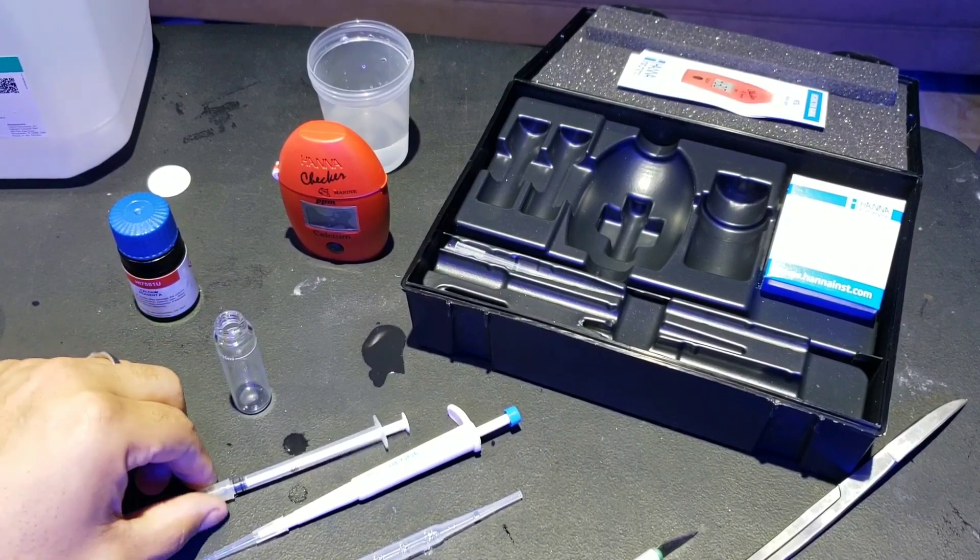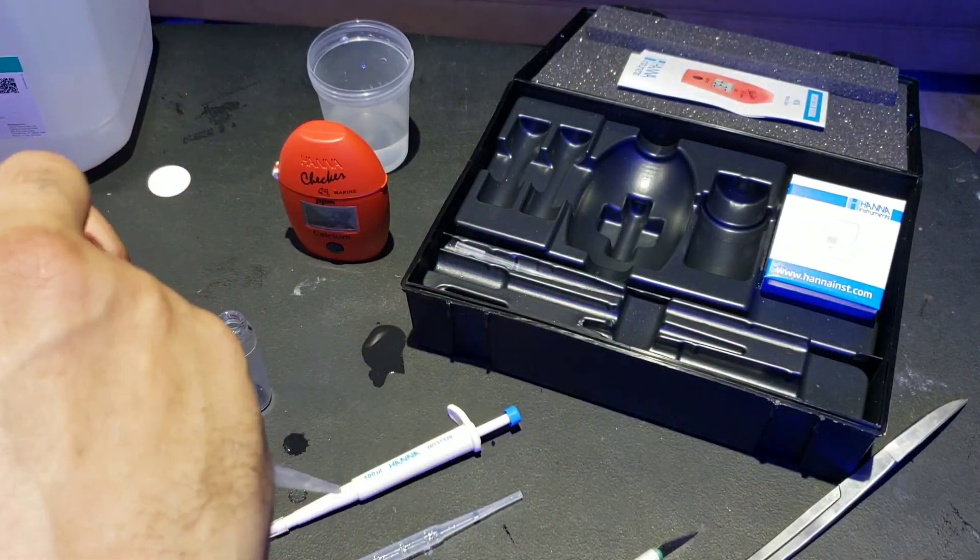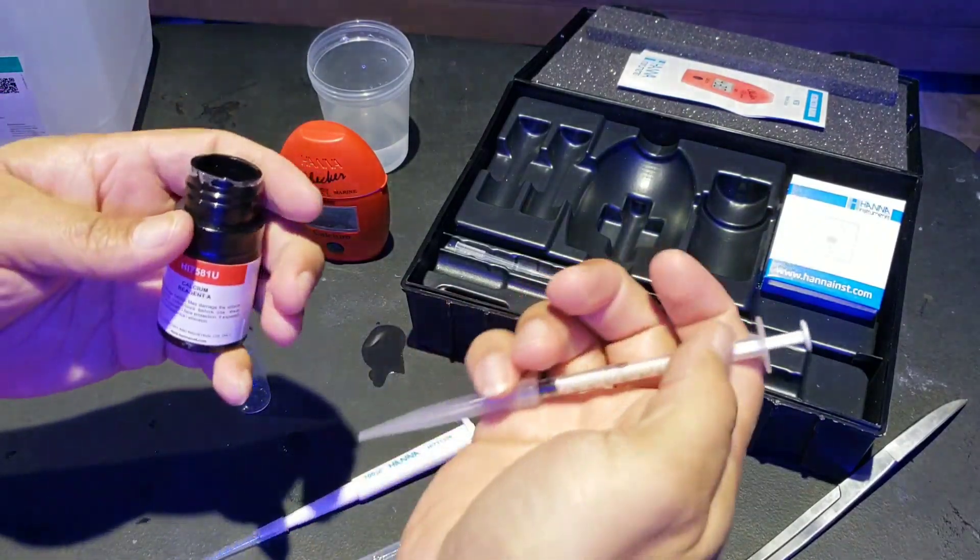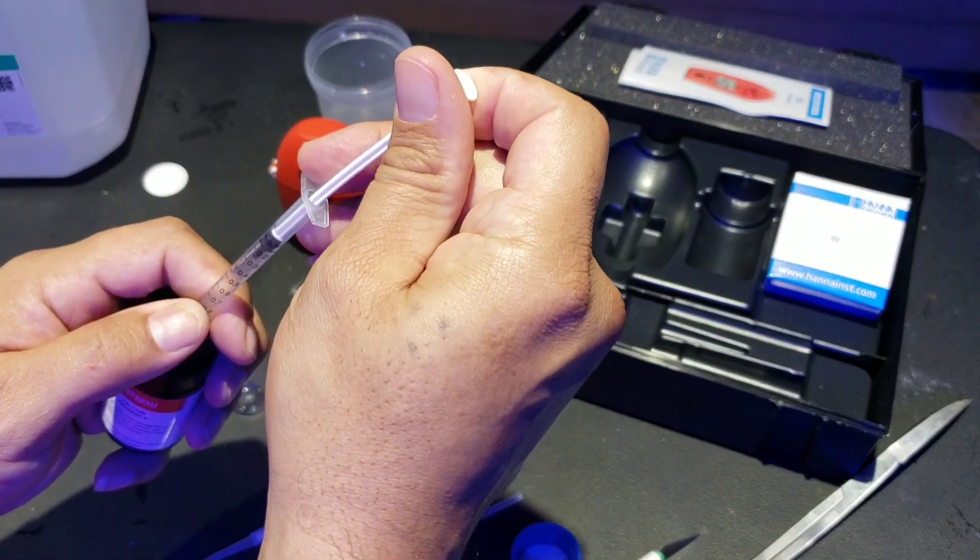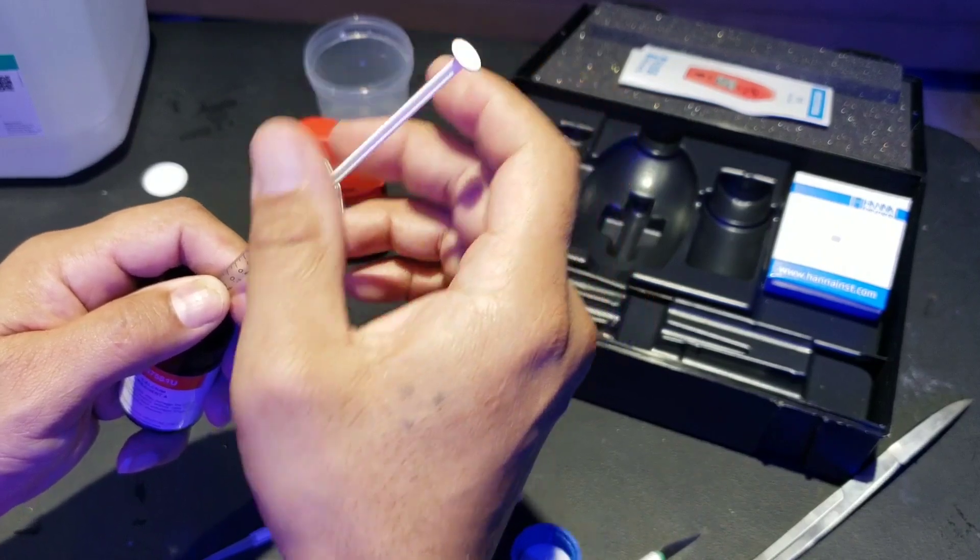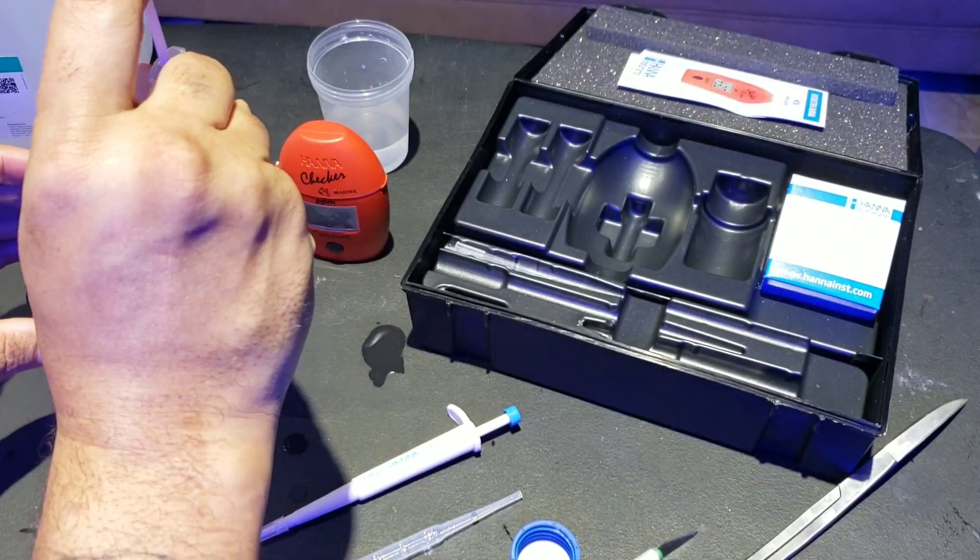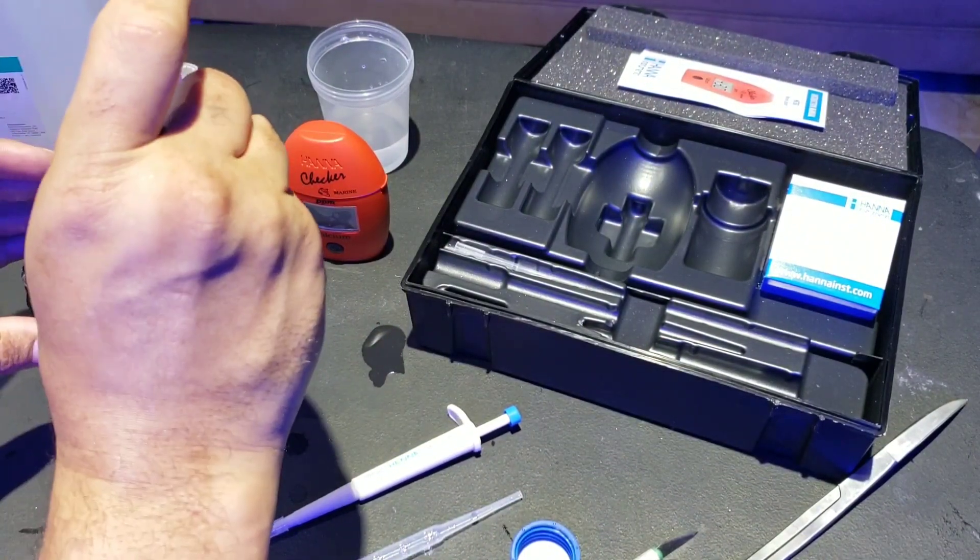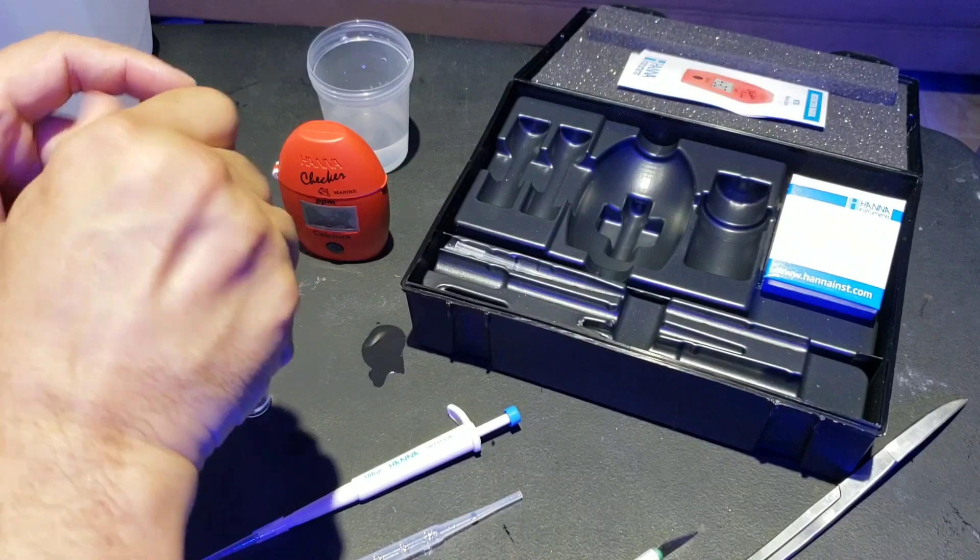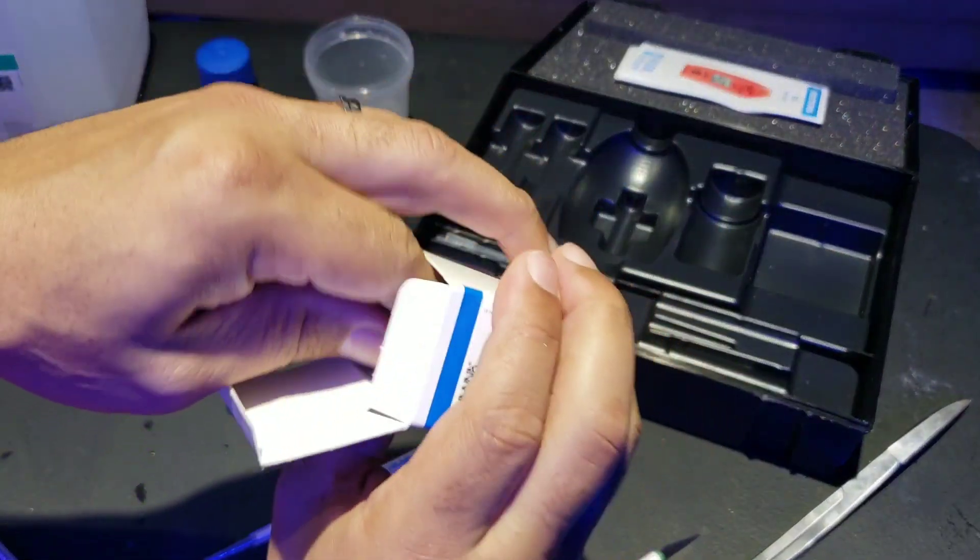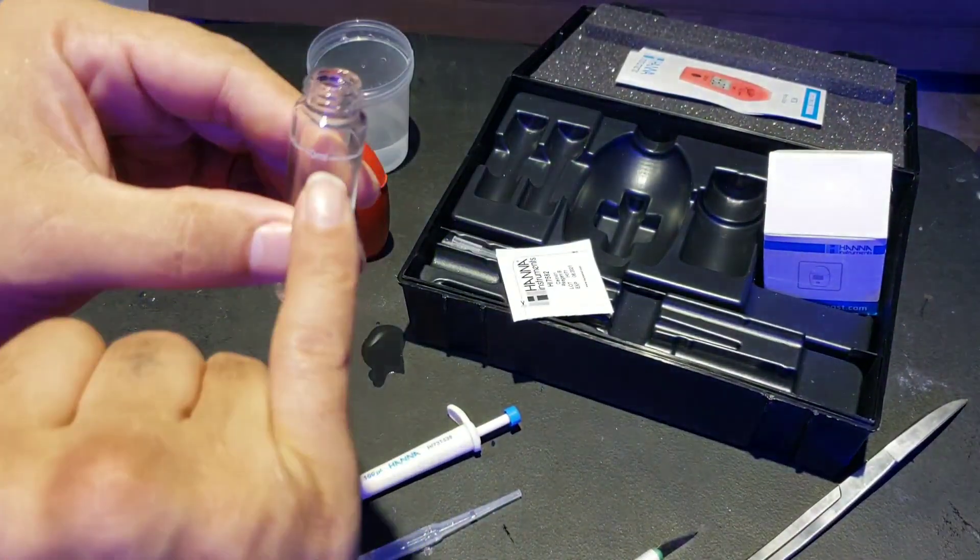What we're going to do is take our one mil syringe here and grab exactly one mil of reagent A. So we're going to take our reagent A, we're going to stick our syringe in here, grab exactly one mil. Get our bottom mark syringe to the one mil mark. We're going to add this into the cuvette. Now, after we do that, tighten this up. We do need to grab one of these.